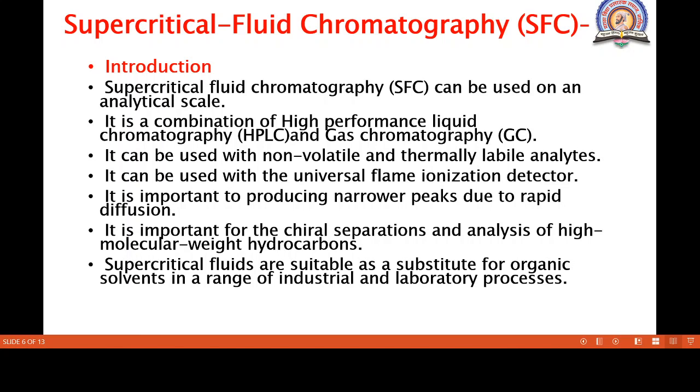So let us see the introduction about this SFC technique. Supercritical fluid chromatography can be used on an analytical scale, means it is also used in analytical chemistry. It is a combination of high performance liquid chromatography, in short called HPLC, and gas chromatography.